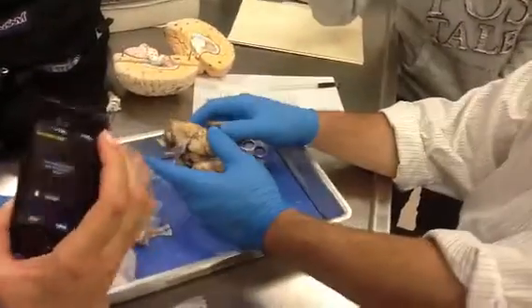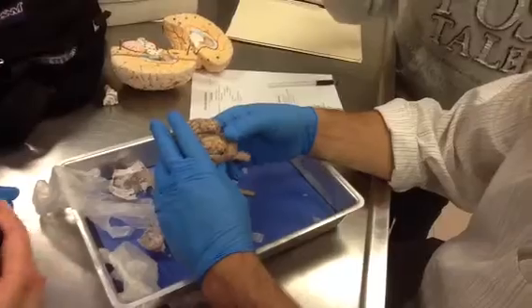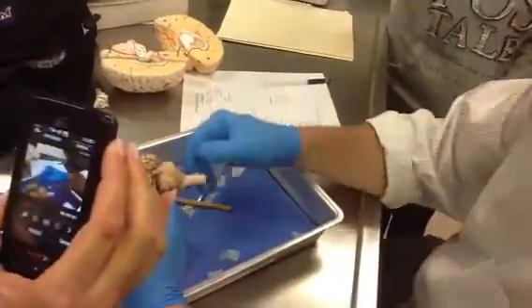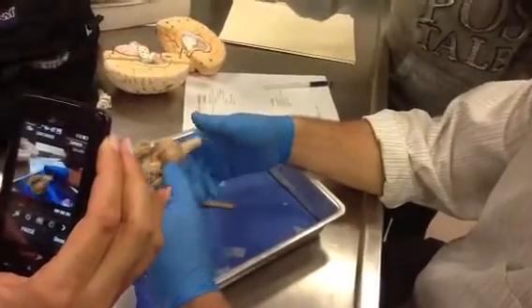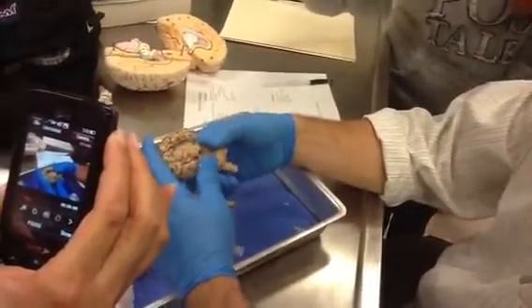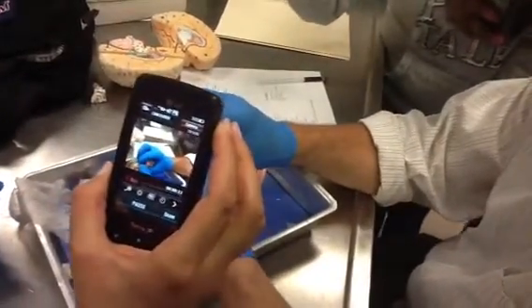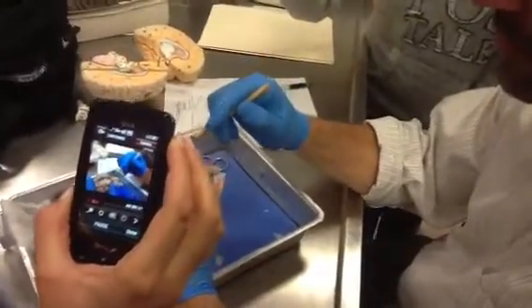You guys want to come here for 1 second? I just want to show you something. Before we cut it in half, there's a part on your list that says right down here, retract cerebellum. I forgot to mention that because then everybody asked me, where's the retract cerebellum located? But basically, it's telling you to retract the cerebellum, pull it back like this. And then what you're going to see, this one's a little bit damaged for some reason. It's unusual.